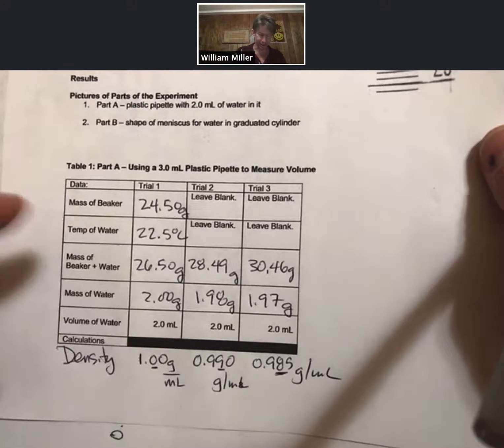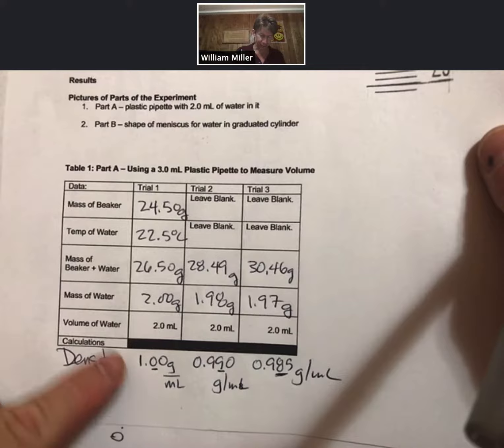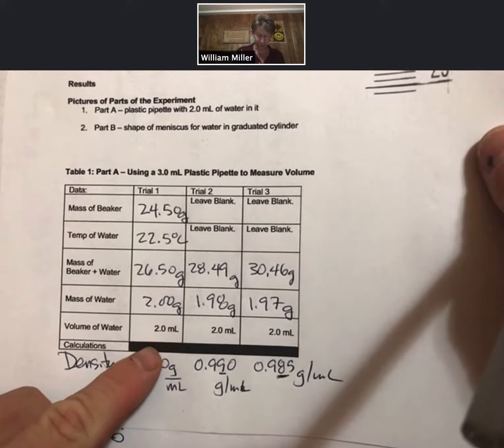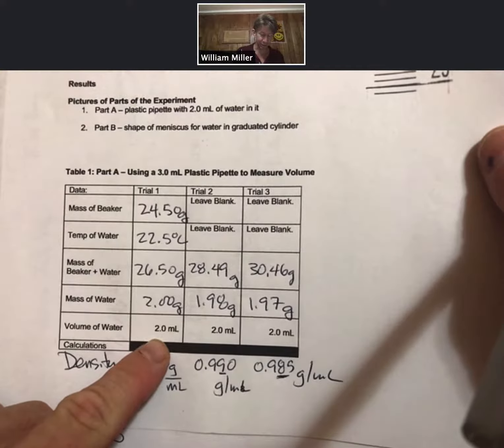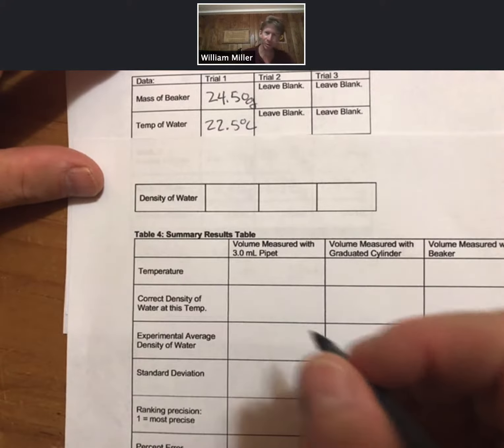I know this is on the next page, but I just wrote them here. I've gone ahead and done my calculations for density according to significant figures, where there's only 2 significant figures for the volume of water. Now, as far as Table 4 goes, our temperature is going to be 22.5 degrees Celsius.